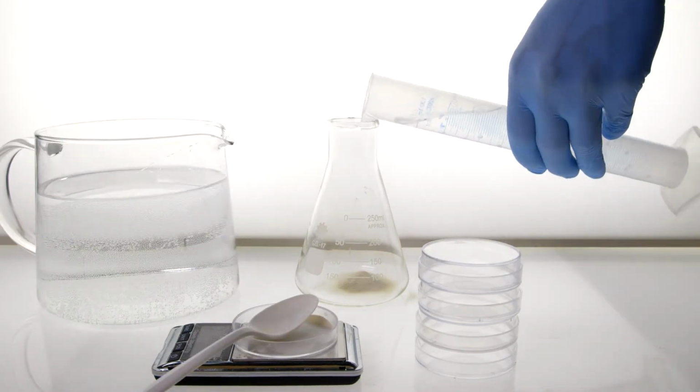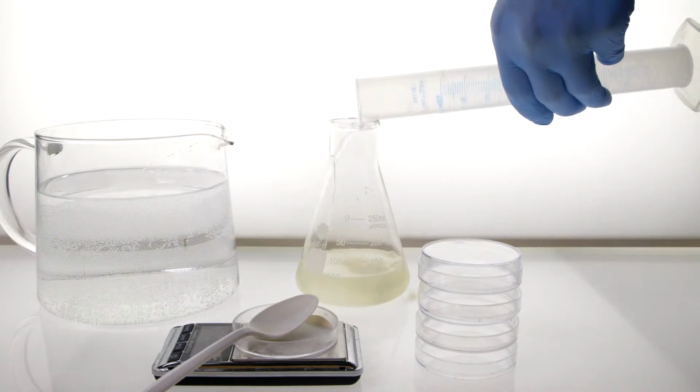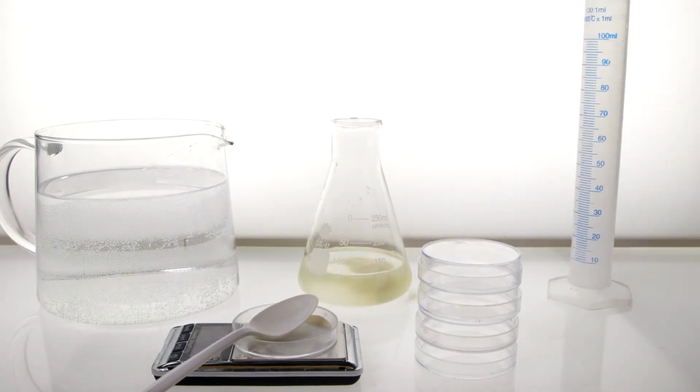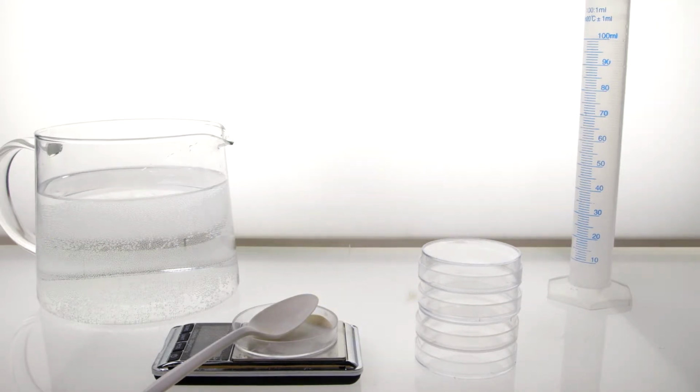For our DIY style methods used here, we've pre-boiled the distilled water for 10 minutes before we use it to kill any bacteria that may have contaminated it. This will have to do because we don't have access to an autoclave right now. Then put a lid over your mixture and microwave it for several minutes. But make sure that you keep an eye on it because it could boil over.